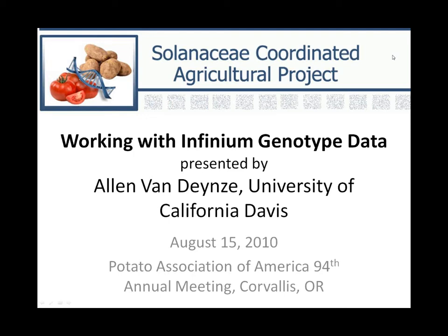For people on the webinar, they won't be able to participate unless they have access to that software, which is proprietary. Yeah, you have to have a license for that software. We're very fortunate that Illumina was able to give us a license for this class and to download it on all these computers. So it is proprietary software you do have to download to be able to use.